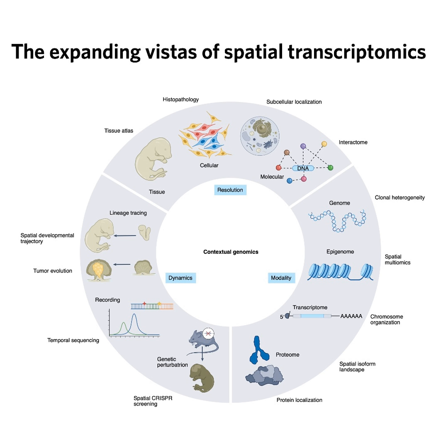And this has very quickly become the technology's most utilized application. It's foundational. I bet. Yeah, researchers have already used ST to create these incredibly detailed compositional atlases for all sorts of tissues: the nervous system, human kidney, the heart, testis, lung. You name it. You are literally generating high-resolution architectural maps of life. Okay, so once you know the composition and the location, the who and the where, the next logical question moves towards their relationships. Yeah. How do they relate spatially?